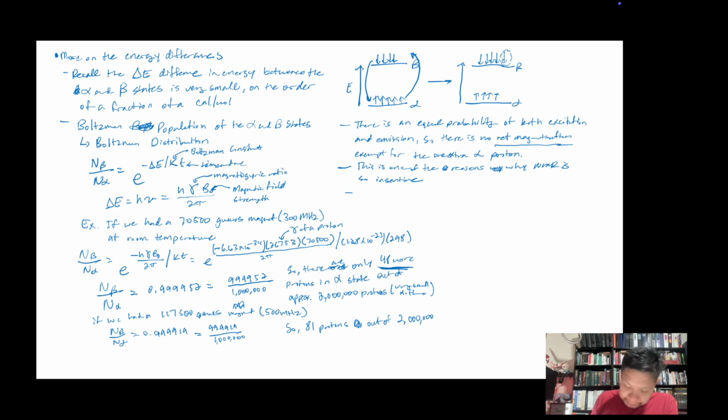And then the last note for this section, which is what you should already know, and I said it already, is that the only way to increase this differential is by increasing the magnetic field strength, right?